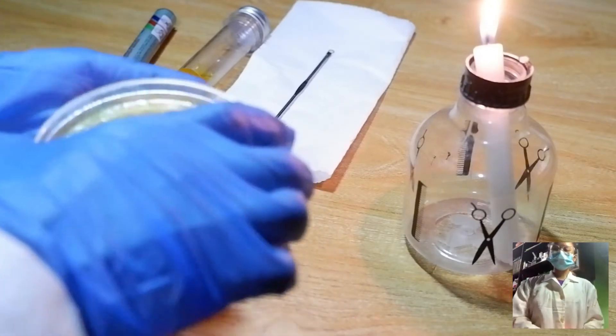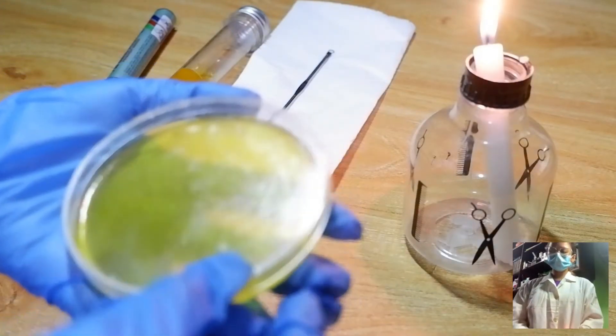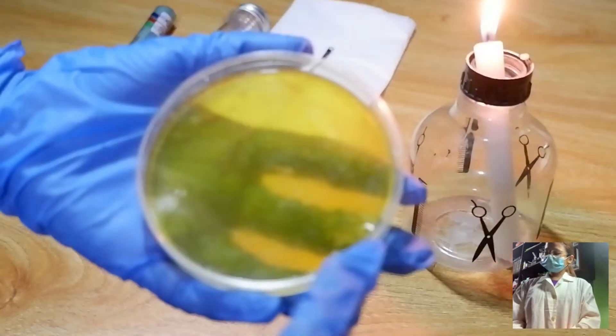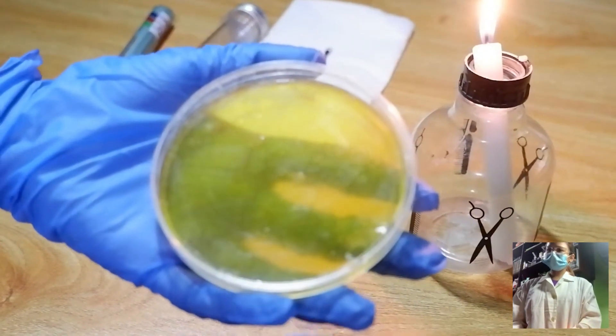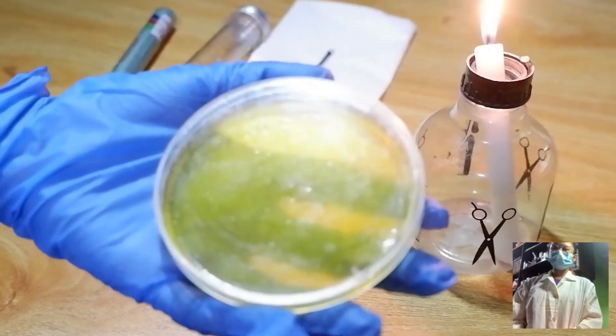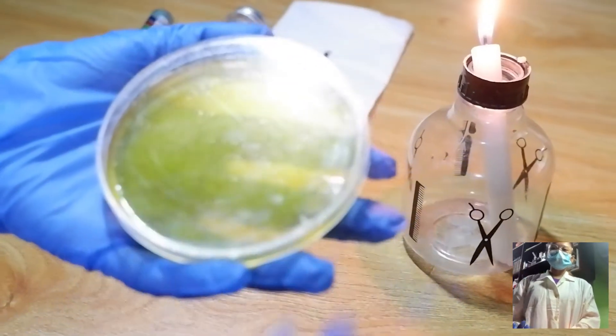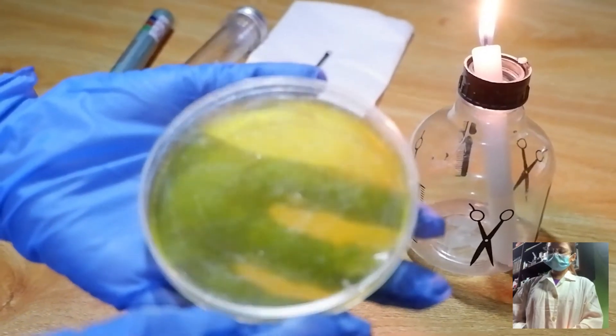First, we will divide our plate with four quadrants in this method. Remember to stay near the edge of the plate where we will do the streaking. In order to make this clear, I will mark the bottom of our plate and identify the four areas.